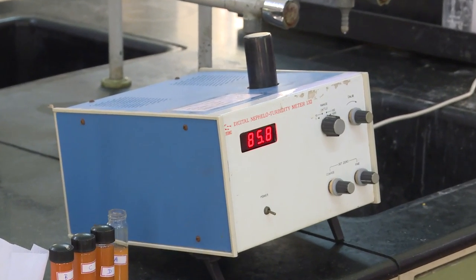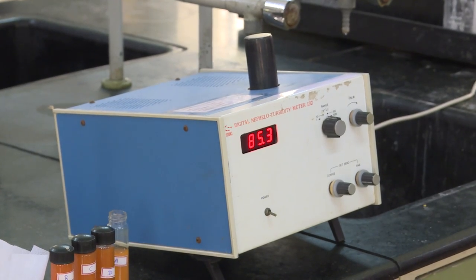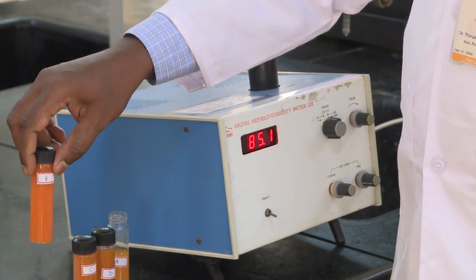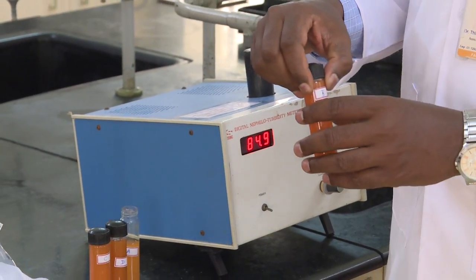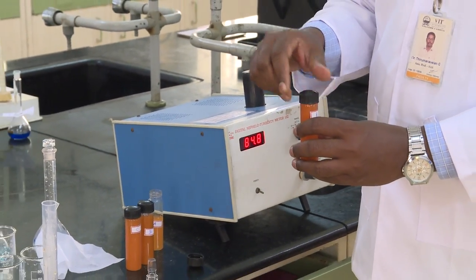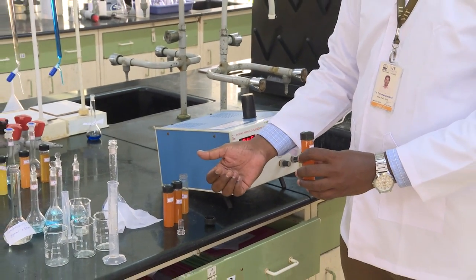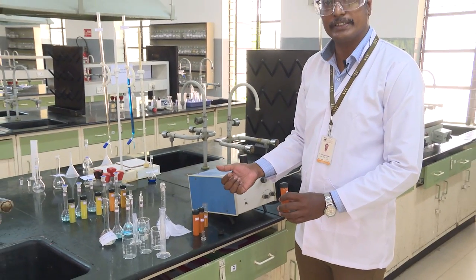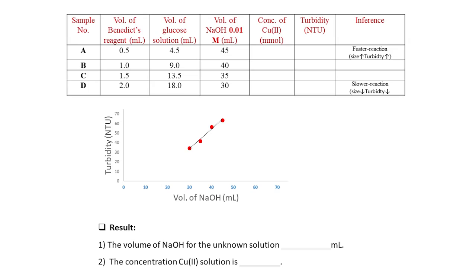Take 10 ml of the solution and 10 ml of conditioning agent, transfer it to the tube, clean the tube so it does not contaminate the instrument, then cap it and note down the values. In this case, 86 NTU is the value for concentration A. Likewise, take 10 ml of B, add 10 ml of conditioning agent, transfer to the tube, and measure the turbidity for samples B, C, and D.